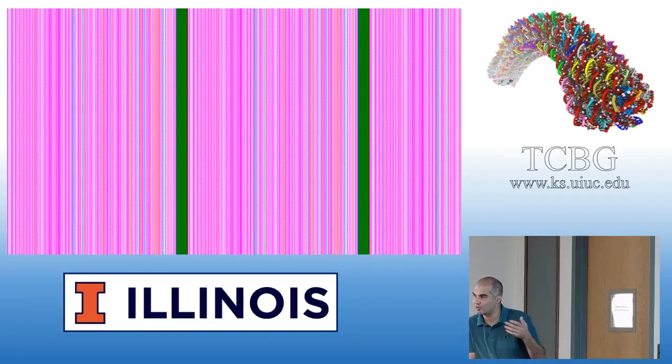So the question is whether this tool will be verified using existing data. When it comes to the protractors, we already have data for those images, so I was comparing with those. Let me actually get the angles that we were supposed to get. The approach would be to use cryo data. When you do cryo, you shouldn't have any support terms. I think we'll get finer details in cryo. But if you want to just get a rough idea of how the shape looks, even twists, I think those are all reproduced from previous data.